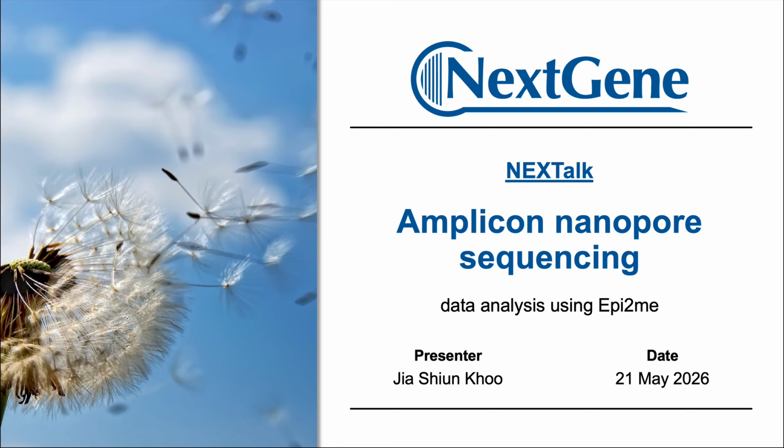The next question is from Citi. Since both nanopore 16S metagenomics and Amplicon sequencing can identify the species, what are the further differences between them? Let me go back to the question again. Amplicon sequencing identifies the species and 16S also identifies the species, right? That would depend on our samples.